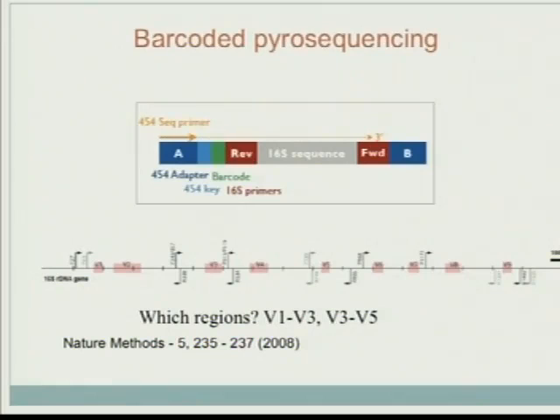But they have to prepare libraries for each sample. It's not very multiplexed. Yes, they need to, but I said they can put different barcodes, so that at least they can do the sequencing at the same time. But they still need to prepare each individual sample. Right.